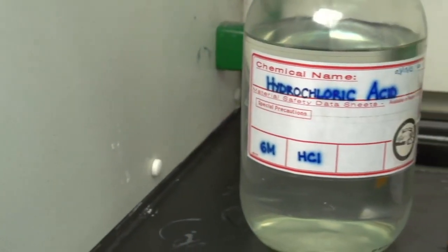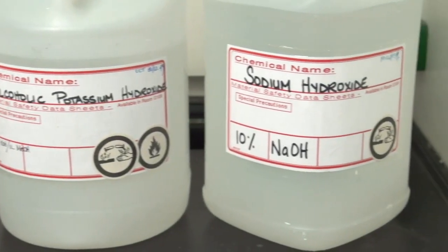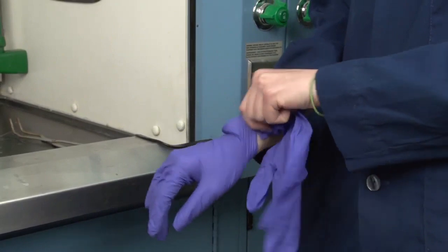If glassware becomes too dirty or contains chemical residue that cannot be washed with detergent and water, it has to be cleaned using a chemical cleaning agent. Chemical cleaning agents are corrosive, so the use of appropriate gloves is mandatory.